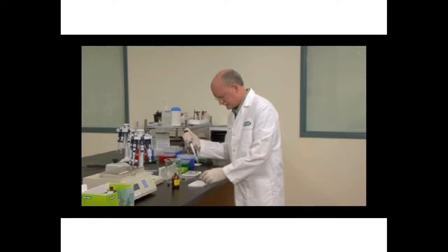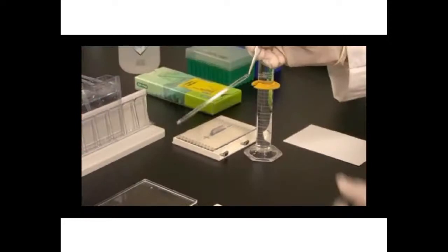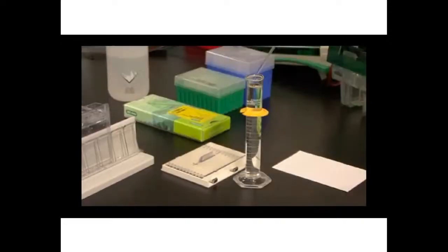To remove the strip from the tray, place the forceps on the tray and gently push on the plastic backing of the gel to push the strip towards the angled edge. Lift up the strip from the right tab. I am going to rinse the strip off in running buffer that I have previously prepared. Dip 2 or 3 times. This will remove equilibration buffer number 1 and 2 that may still be on the surface of the IPG strip. Place the IPG strip gel side up. Place the plastic backing against the back of the cassette.